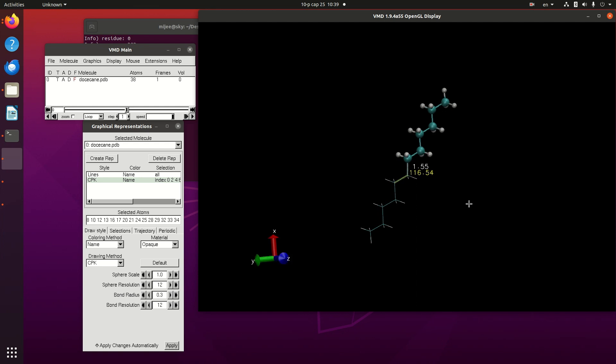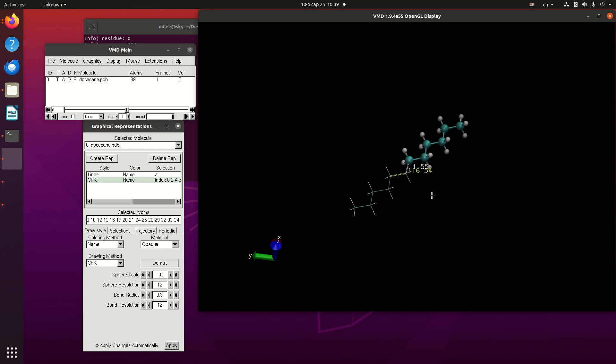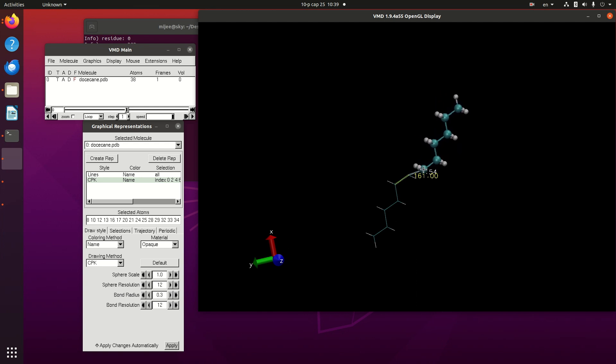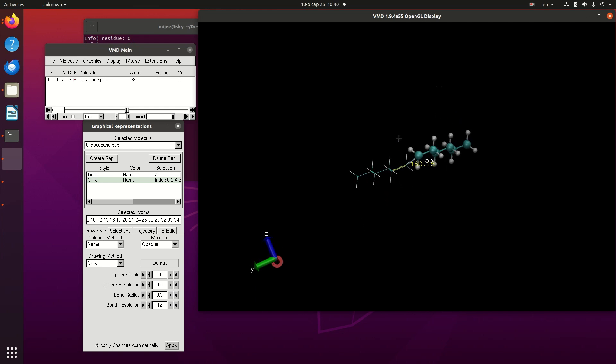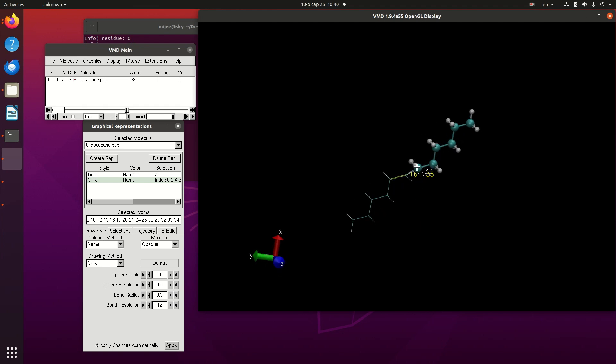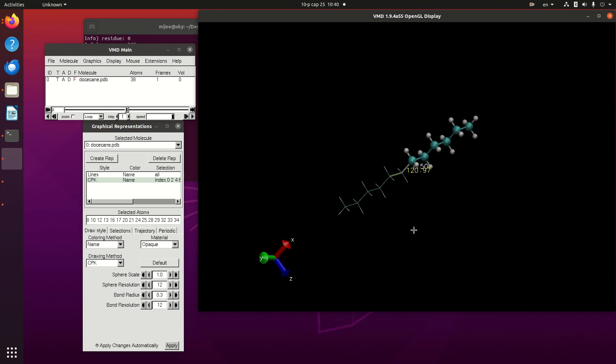We changed the angle value and we can also change more to 160 degrees, such as 120. And the bond length we can also control using this bond name.